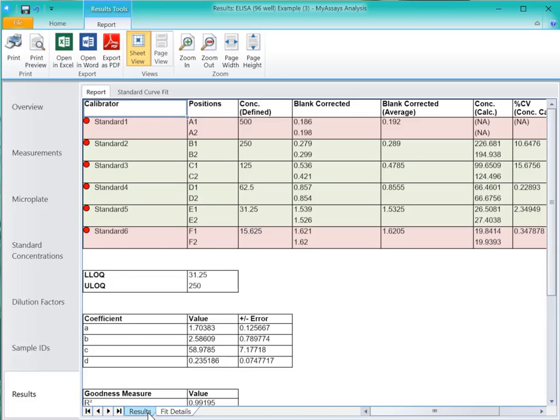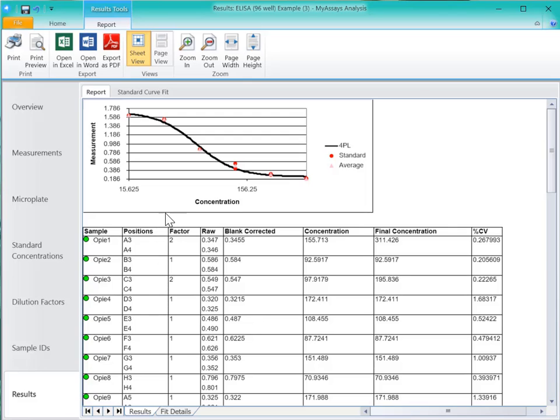On our Results Sheet, you can see the Standard Curve Fit and our sample table. In the sample table, you can see the sample IDs that we imported, their positions, the dilution factors we entered. You can see the factor 2 for our unknown 1, which is OP1, and unknown 3, which is OP3.